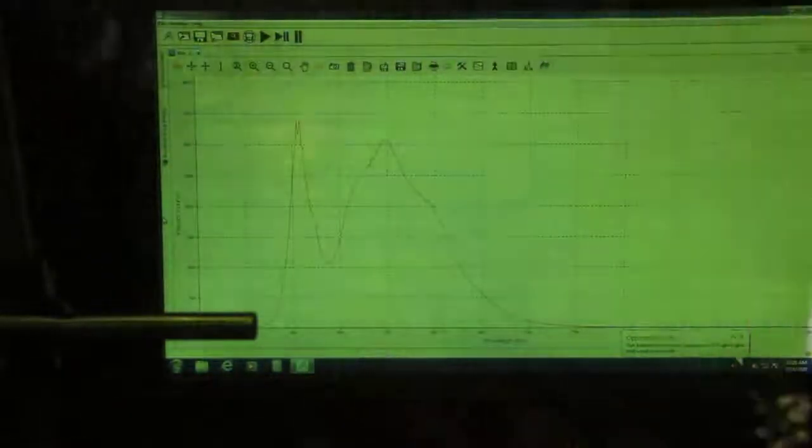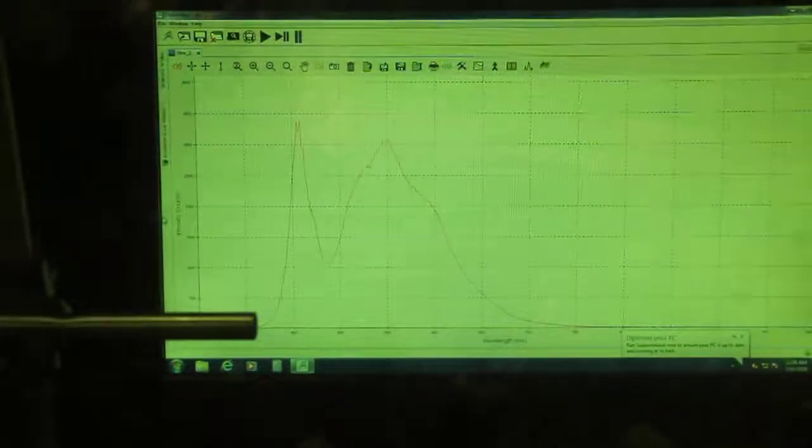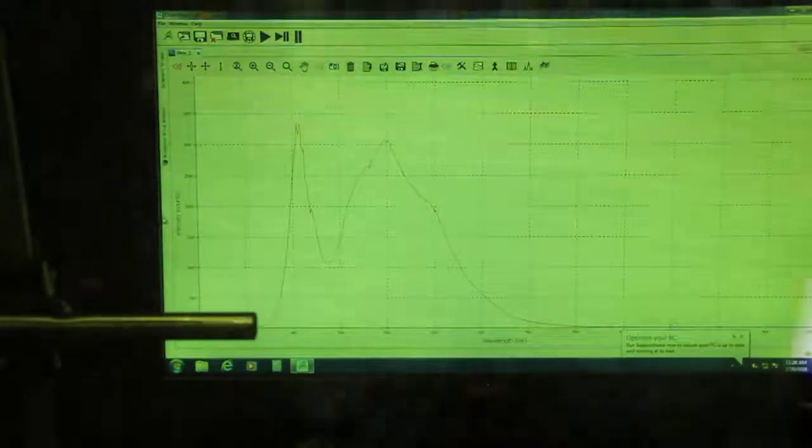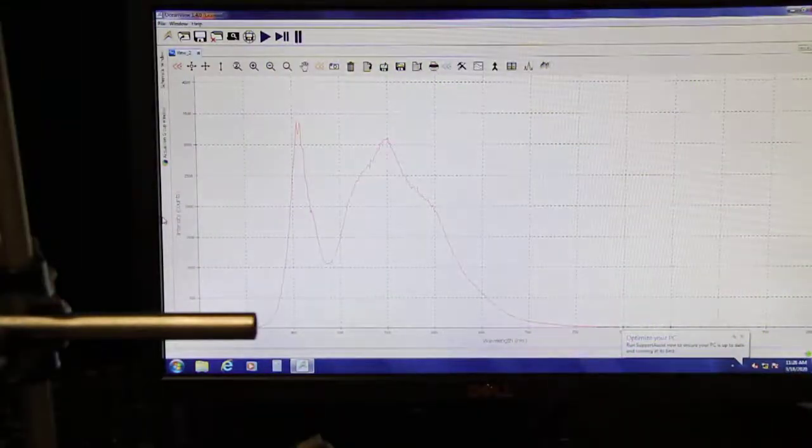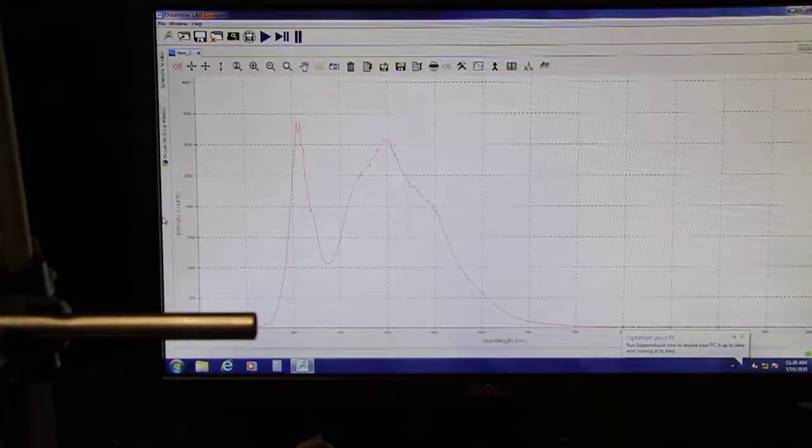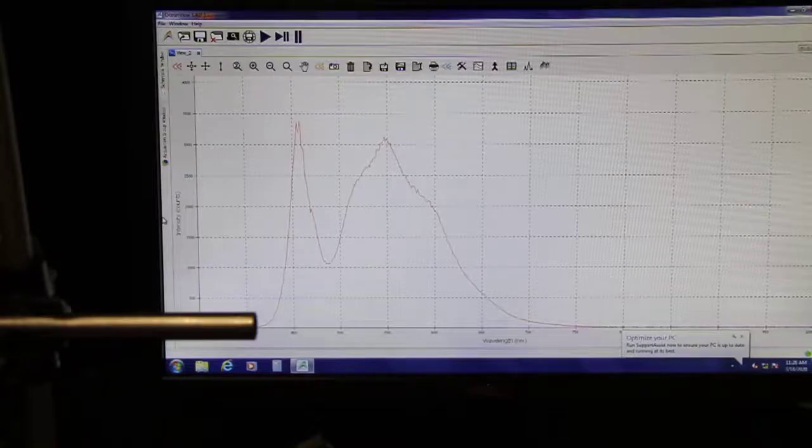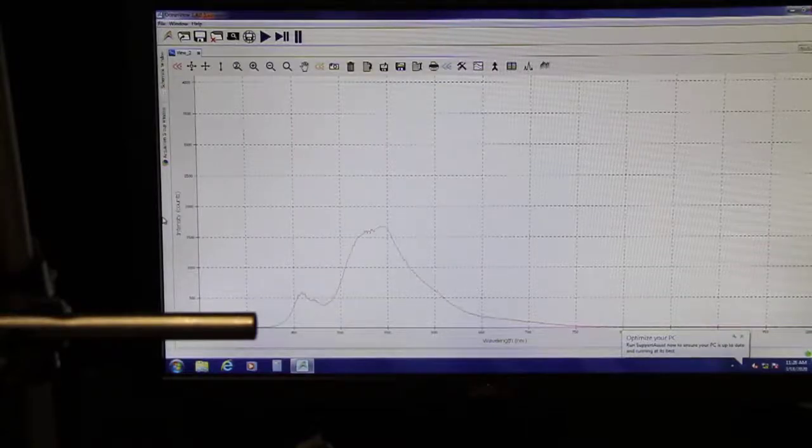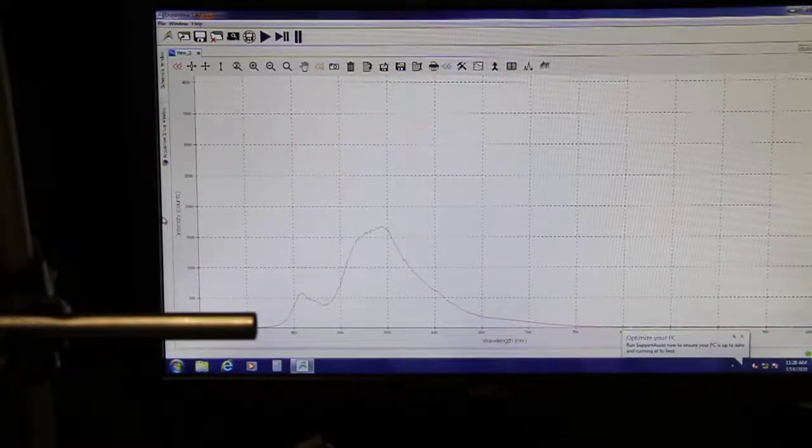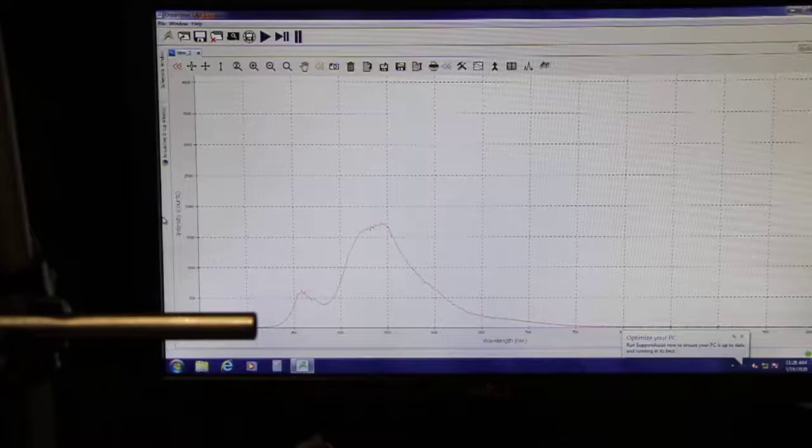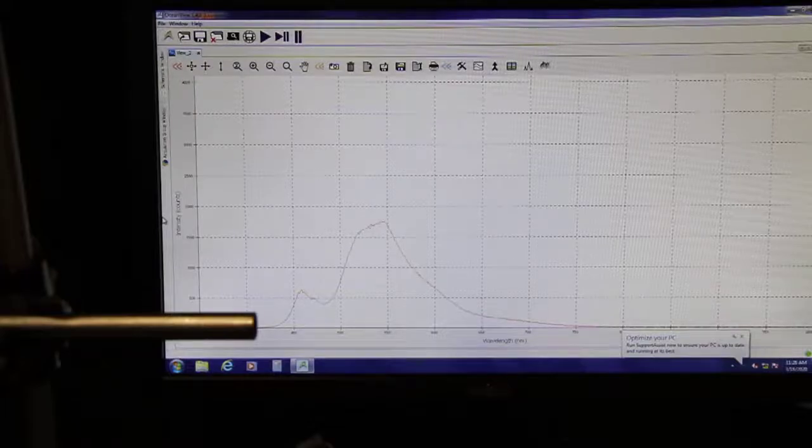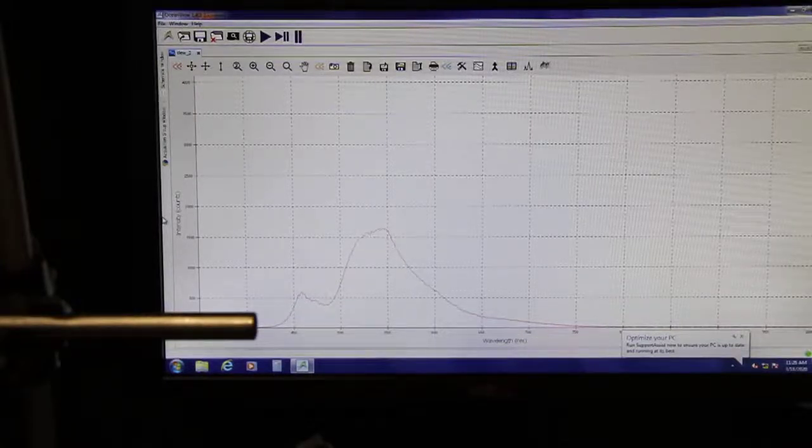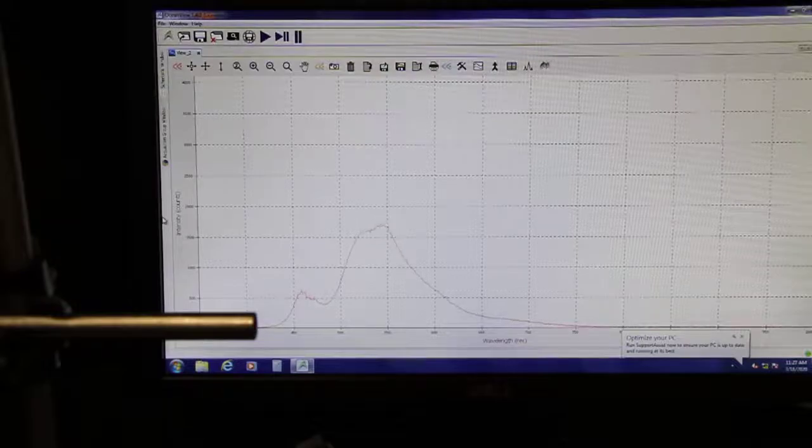Here is the green cellophane. We're going to put it between the white light and the spectroscope. What color corresponds to the peak wavelength? Is that what you expected?